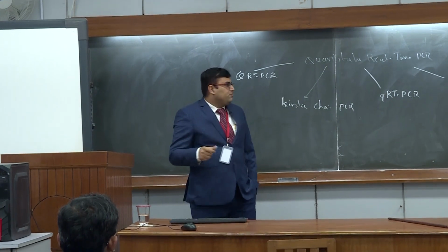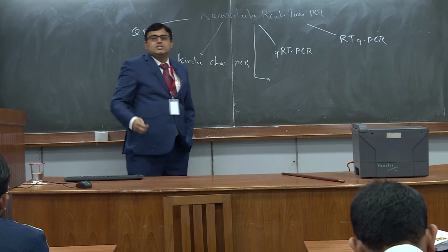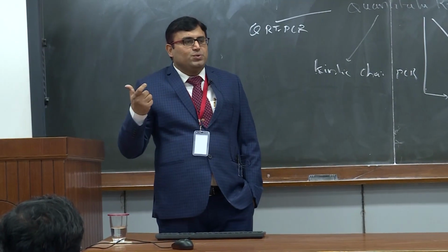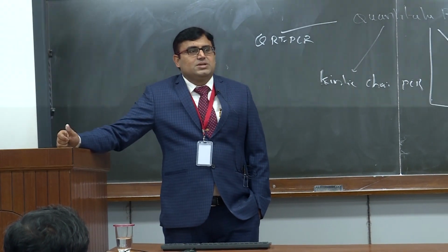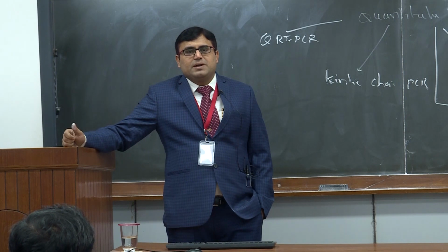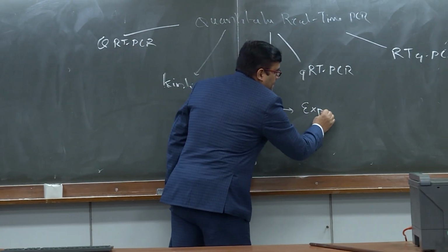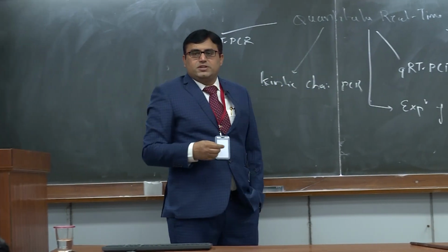First and foremost, we have to understand the utility or use of this particular technique. Unless you know the use, you cannot decide where to fit it. Quantitative real-time PCR is used for, first, as I told, expression analysis of a gene.